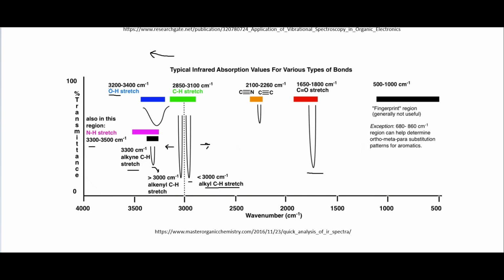But we also have these large dipole moments here. So the oxygen to hydrogen bond and the nitrogen to hydrogen bond. And so that will give us those high frequency vibrations there. Then we have the C to N, C to C. So those do have the triple bonds, which would increase the vibrational frequency, but they're on these two different heavier atoms rather than the H's that we're looking at over here. And so that's going to reduce the vibrational frequency.